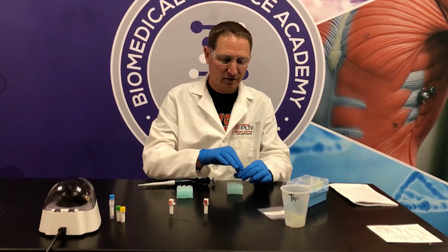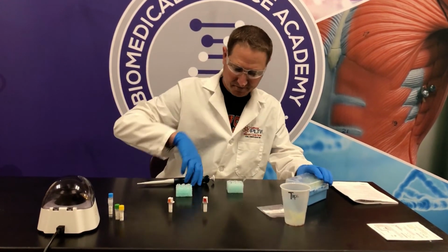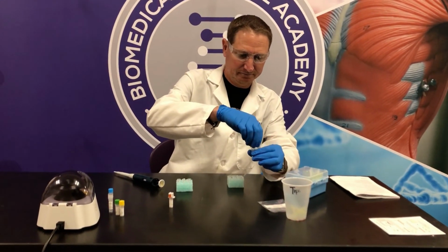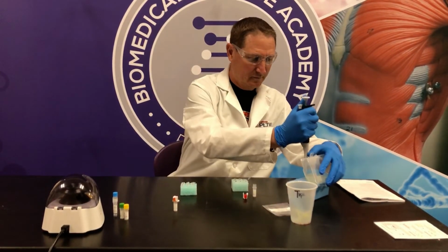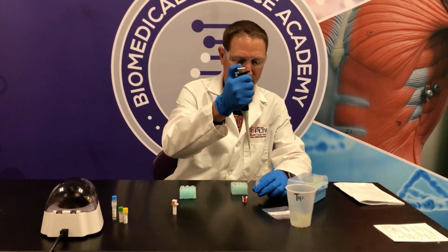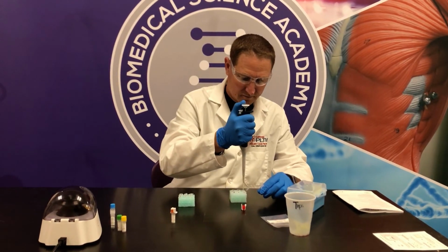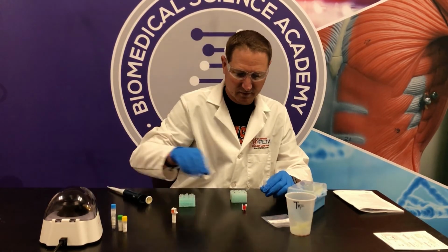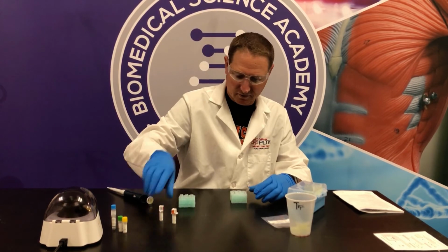Okay, now I'm going to do my EcoRV. I'm going to open that one there. I'm going to grab my EcoRV and open this. I have this set at 14 micros. Get rid of the tip. Recap. Close this one.